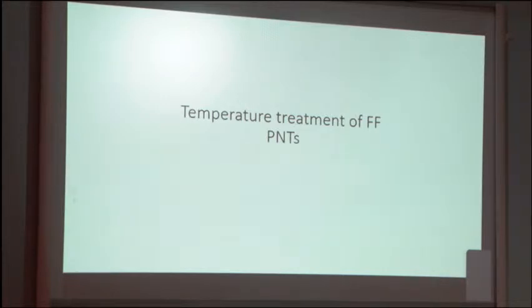Temperature dependence is possible to measure in atomic force microscopy, but technically for AFM, 200 Celsius is a high temperature, because the silicon cantilever is sensitive to temperature: it can be destroyed, resolution decreases, conductivity changes. It's not possible to do measurements at high temperature.